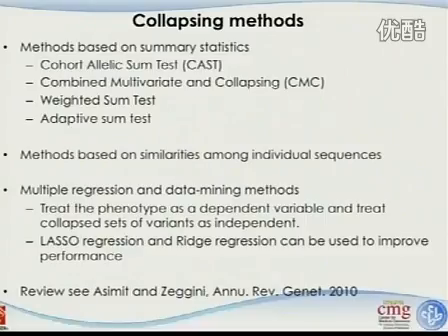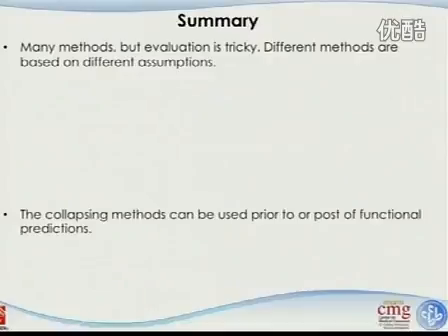Again, when we go back to the previous slide, there are so many different methods, and I just feel it's amazing. I was in a meeting earlier this week on statistical methods in next generation sequencing data analysis. At the time, most people didn't have the data yet, and there were already probably 24 methods developed. People start comparing those and saying this is a generalized form and that's a special case. I just feel it's really amazing that people can develop those statistical models without any real data. That brings up the problem that evaluation becomes very tricky, because even when we have the real data, we wouldn't know what the right answer is.